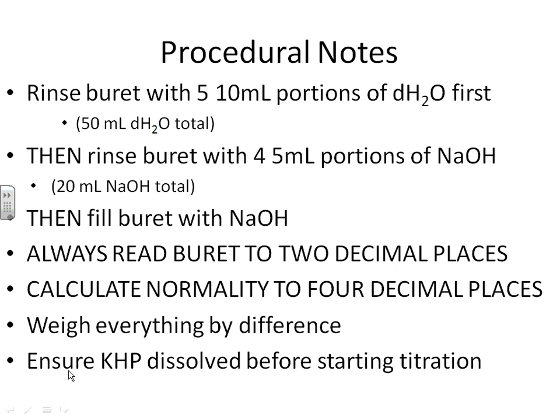There's a difference between determining the concentration of something and standardization. You will be doing standardization. Regents kids determine concentration of something. I would never in a million years call what my Regents students do standardizing anything. Yes, they are determining the concentration of something, but they're not doing it precisely, and they're certainly not doing it terribly well. So the idea of precision, the idea of knowing our results and making sure our results agree to a really, really fine point is what separates standardization from regular old titration.